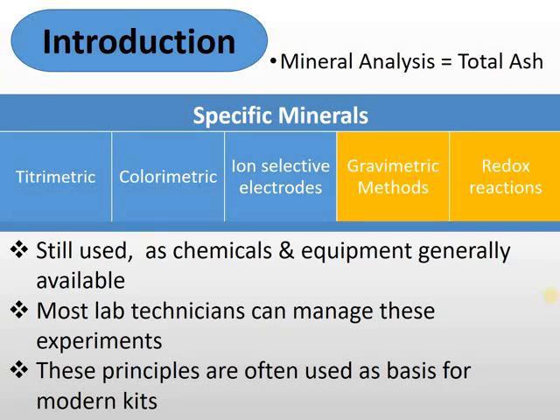what's in there. However, the three methods that I mentioned earlier on, your sodium chloride, sulfur dioxide, and titratable acidity, go a step further and specify which minerals are actually in the food product, and also quantify how much of that mineral is found in there. So it's not just crude, it goes down to specifying the amount and the type of mineral.